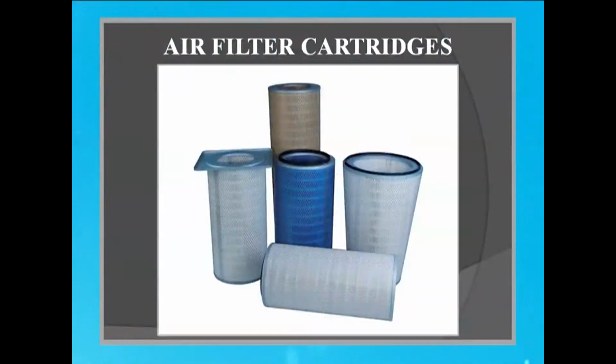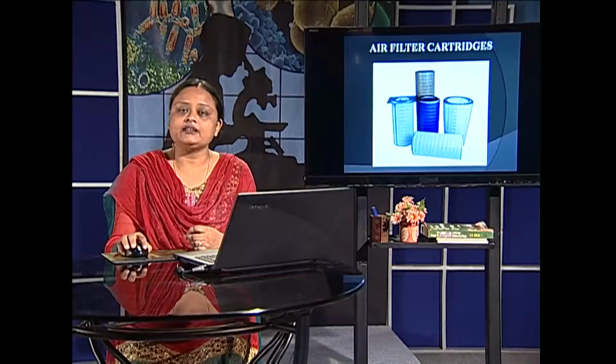And we see some of the cartridges. Filter cartridges are most often required for the sterilization of air that has to be done in the industries. The air should pass through these cartridges and be filtered before it can enter the bioreactor, because it should not contaminate the contents of the bioreactor. So a brief protocol of sterilization has been followed. Although it looks and sounds very simple, it is really difficult to maintain aseptic and sterilization conditions in the industries, and most often the loss in yield of a product is because of difficulty in maintaining aseptic and sterilization conditions.